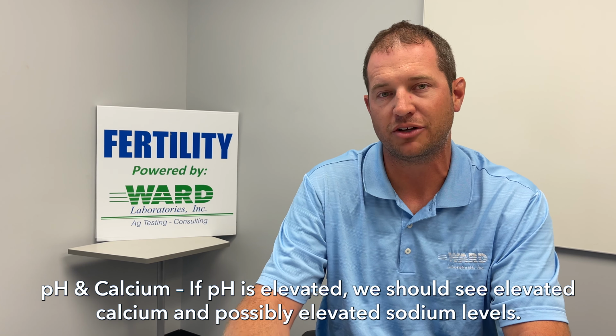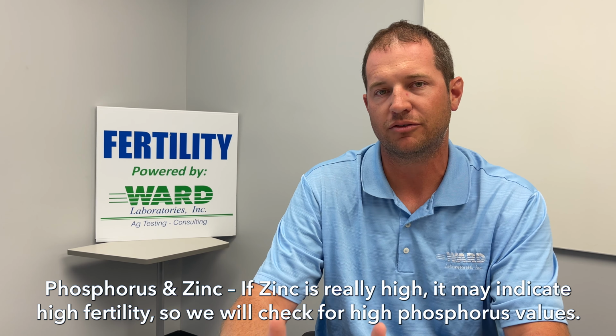Another quick check is phosphorus and zinc. If you get really high zinc levels, maybe that's an indication of high fertility, so we should look for higher phosphorus levels too. Those are some things that move together, and we're looking at those different things in that final review process.